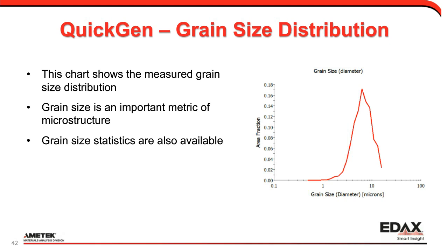There are orientations to show our inverse pole figure, crystal directions, quaternions, Euler angles. There are grain size information, so diameter or area or ASTM number. Then grain shape. Are they elongated? Are they equiaxed? Are those aligned in a certain spatial direction? There are grain average values, and then there are a section on local misorientations, the CAM maps or the GROD maps or the local orientation spread maps, as well as some other sections.